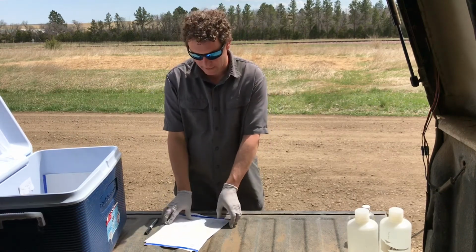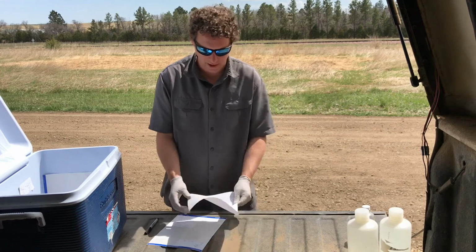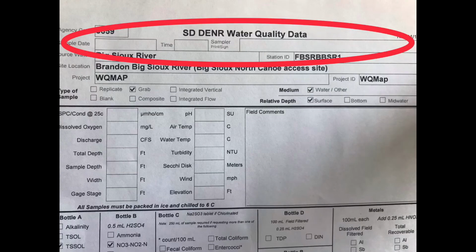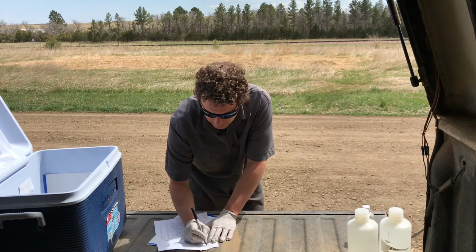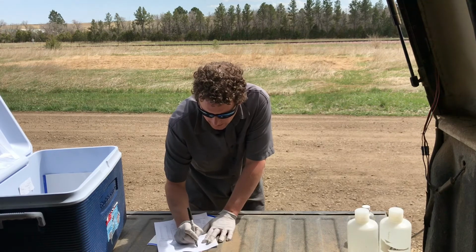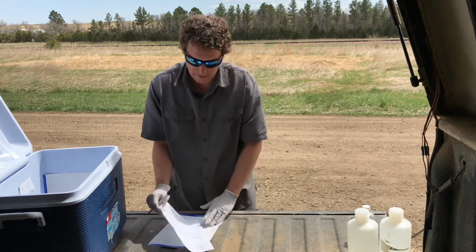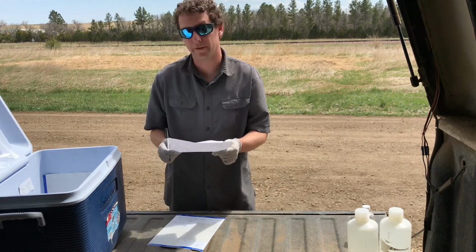Then the last thing that we have to do is fill out our data sheet. And just like the labels, the only thing that we need to fill out here for the chemistry sample is the date, the time, and our initials. If you have any YSI measurements or multimeter measurements, you would also mark those down on the sheet. So I'm going to put the date, time, and my initials.